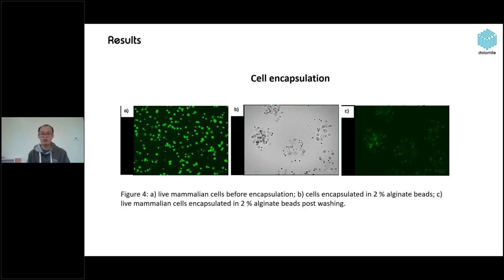Due to the porous alginate structure, it is possible to grow cells in the bead, and nutrients and gas can readily exchange via nanopores in the bead structure. So this method can easily be adapted for creating a microreactor or for other sensitive active agents requiring microgelation and encapsulation.